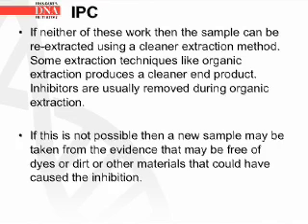Some extraction techniques like the organics extraction produce a cleaner end product. Inhibitors are usually removed during organic extractions. If this is not possible, then a new sample may be taken from the evidence that may be free of dyes or dirt or other materials that could have caused the inhibition.